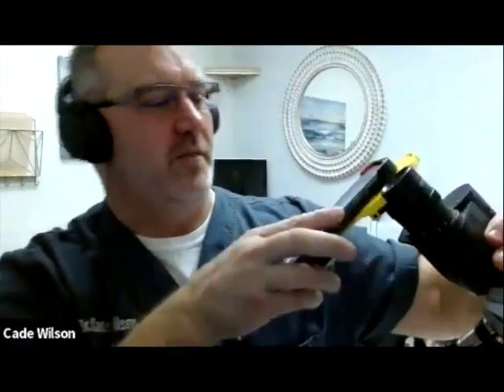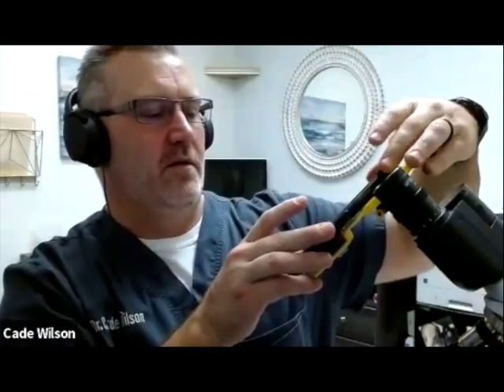In a situation where you've got multiple users, you have to figure out how to get it lined up. Let me line it up. You still get the same outcome. It's a little slower as far as me getting it lined up, but it's not that much slower.